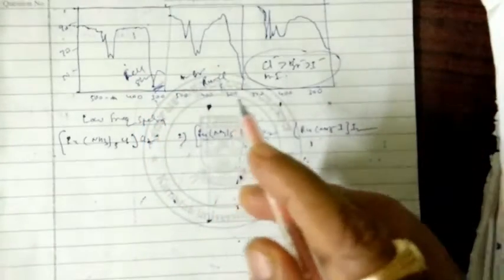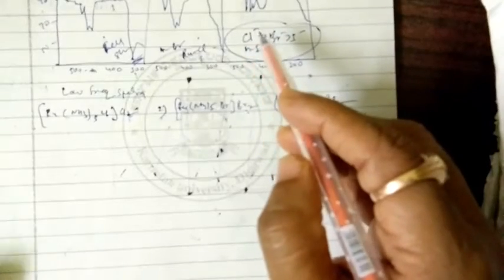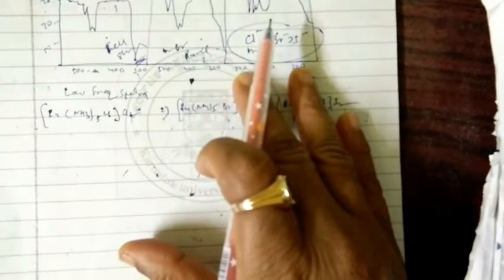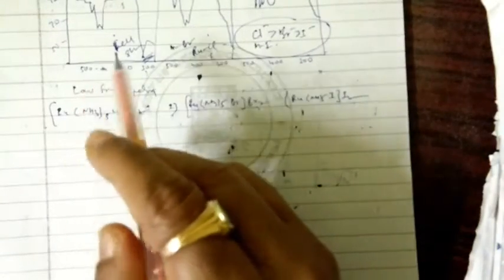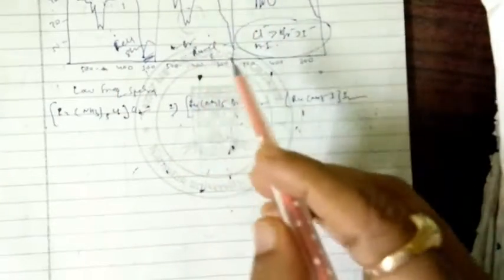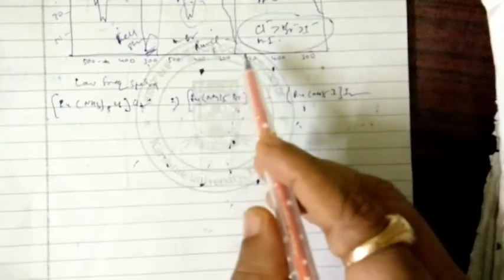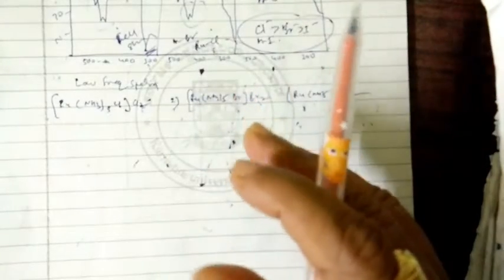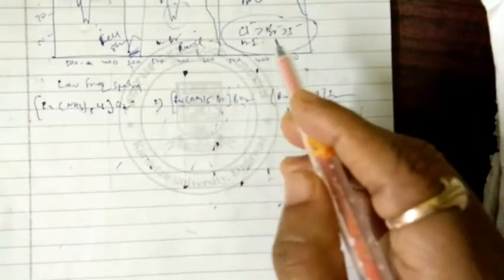The other Ru-X stretching vibrations you can see beyond this range. The three bands are attributed to ruthenium nitrogen stretching vibrations. You can see weak bands between 490 to 440 cm-1 for the chloride and bromide complexes, and the band at 424 is present here. This also depends on the molecular symmetry, C4v, C3v, in this way.